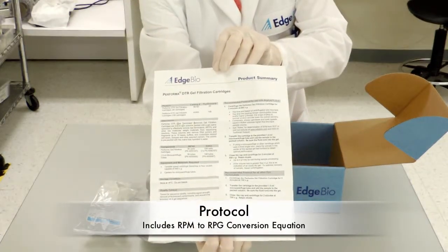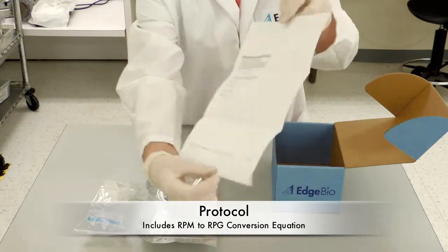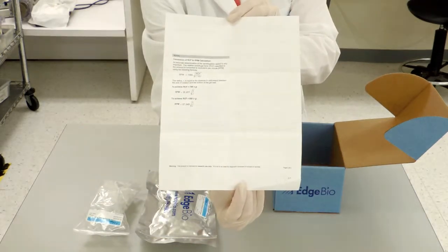And a protocol which, like before, contains detailed instructions about the product along with how to carry out RCF to RPM conversions.